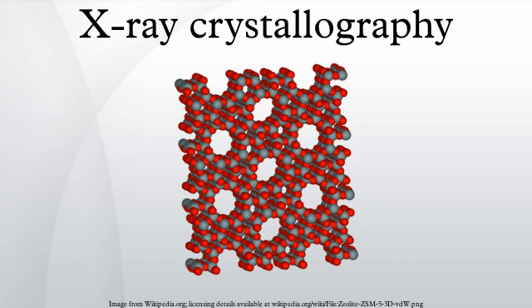For comparison, the nearest competing method in terms of structures analyzed is nuclear magnetic resonance spectroscopy, which has resolved 9561 chemical structures. Moreover, crystallography can solve structures of arbitrarily large molecules, whereas solution-state NMR is restricted to relatively small ones. X-ray crystallography is now used routinely by scientists to determine how a pharmaceutical drug interacts with its protein target and what changes might improve it.